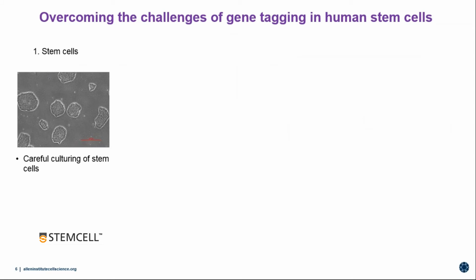So we had to overcome a few challenges, because we are working with stem cells. Just to highlight again, careful handling of stem cells before and after gene editing has made a big difference in creating these lines and creating an efficient pipeline of gene edited cells.